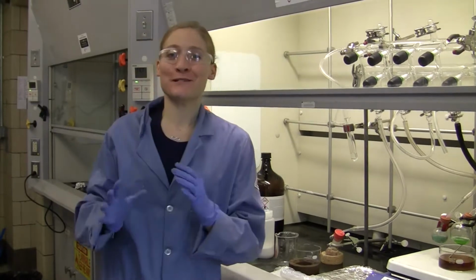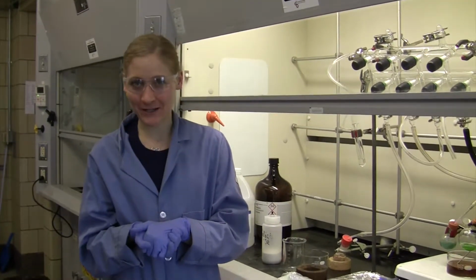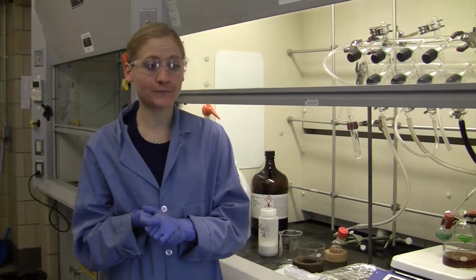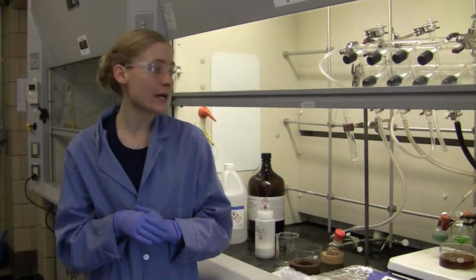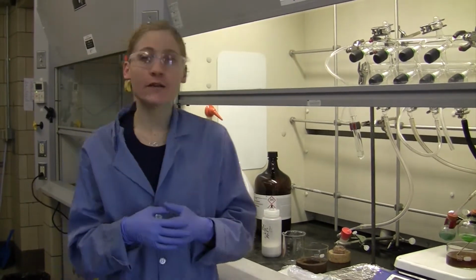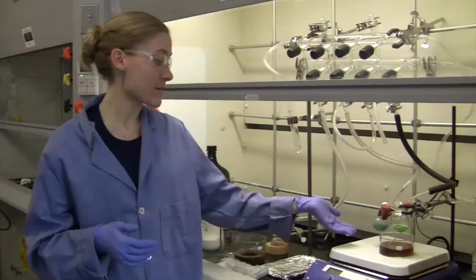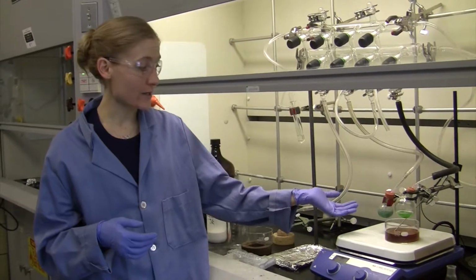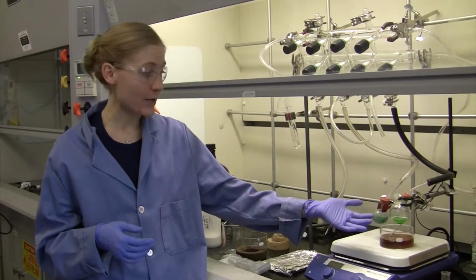Now that the teaching moment is done, again, I'm Professor Stephanie Sidlick in the chemistry department here at Carnegie Mellon, and we are talking about the molecular basis of polymer mechanics in my course this spring. This is day 2 of our laboratory module, which involves polymer purification. Last time we set up an air-free synthesis of our polybutyl methacrylate, and here I have a completed synthesis, so it's gone for 24 hours.